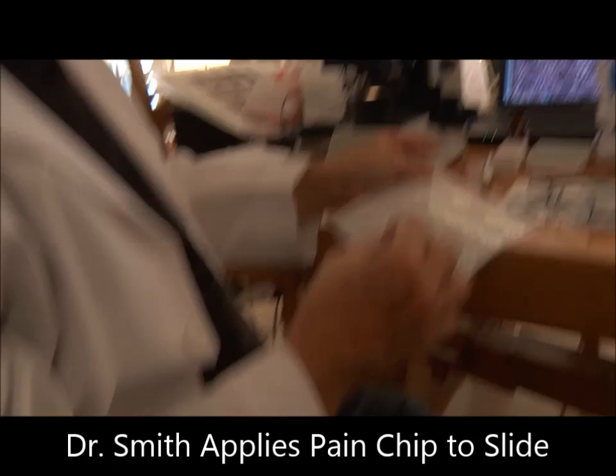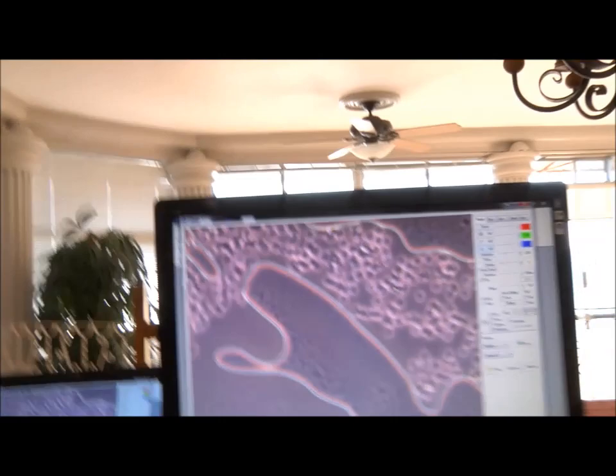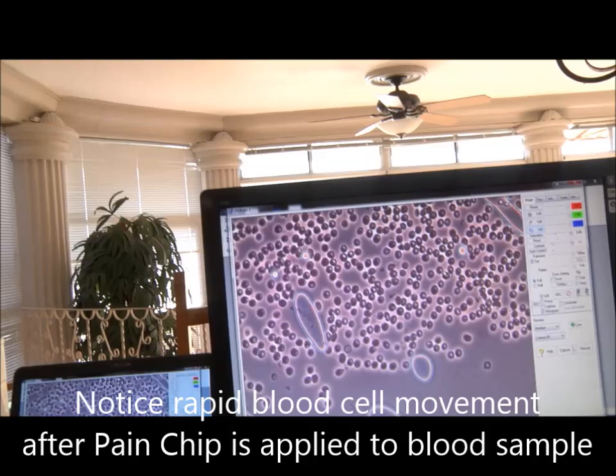It is possible — remember I told you earlier that we should wait about three minutes and I didn't. So all you're doing now is taking the pain chip and putting it right on that slide. Hold it — and now here's the blood. There it goes.